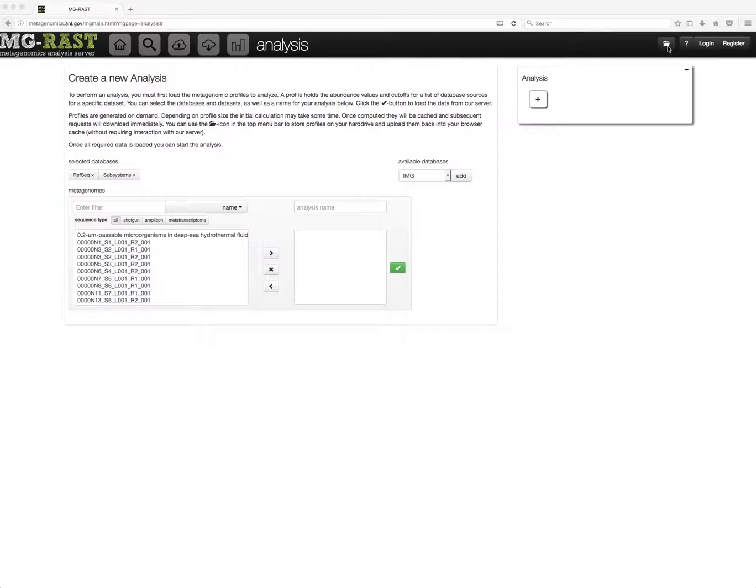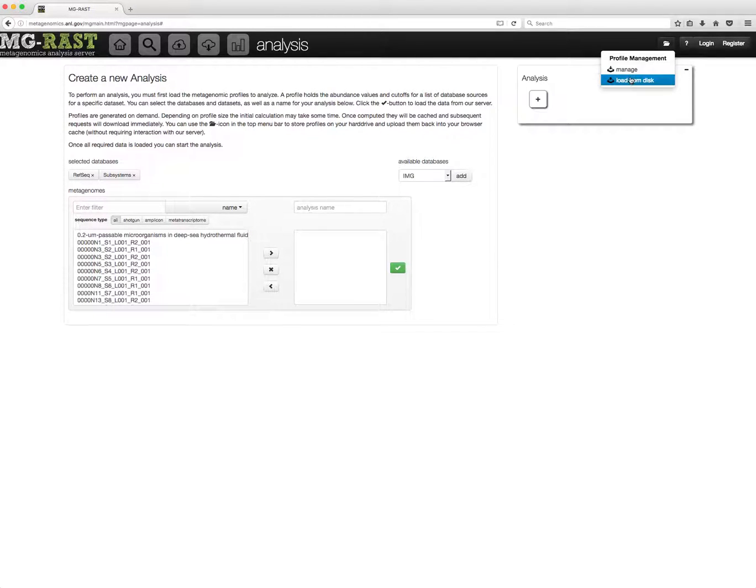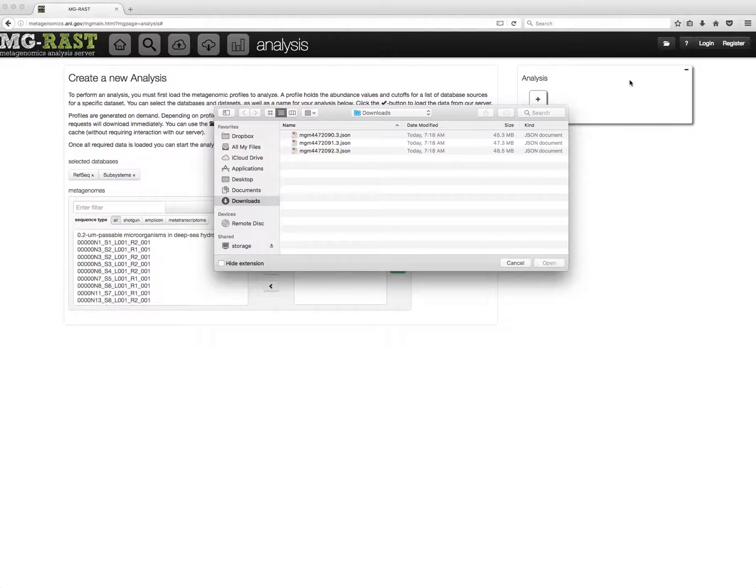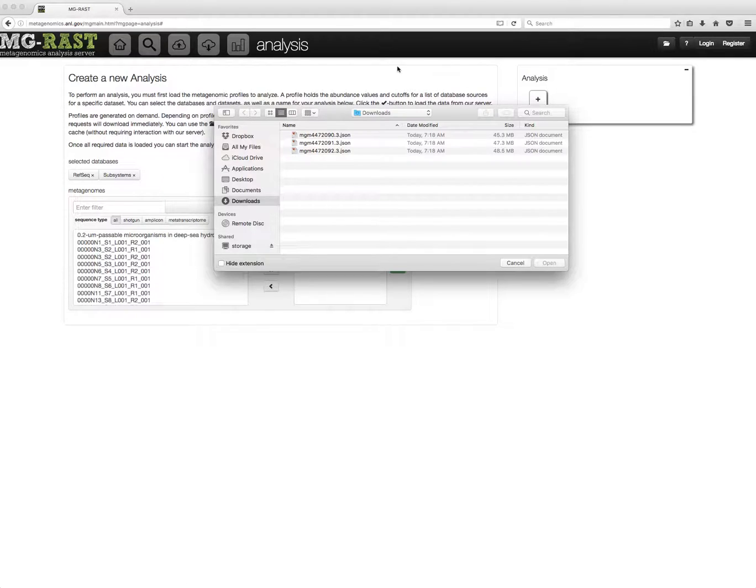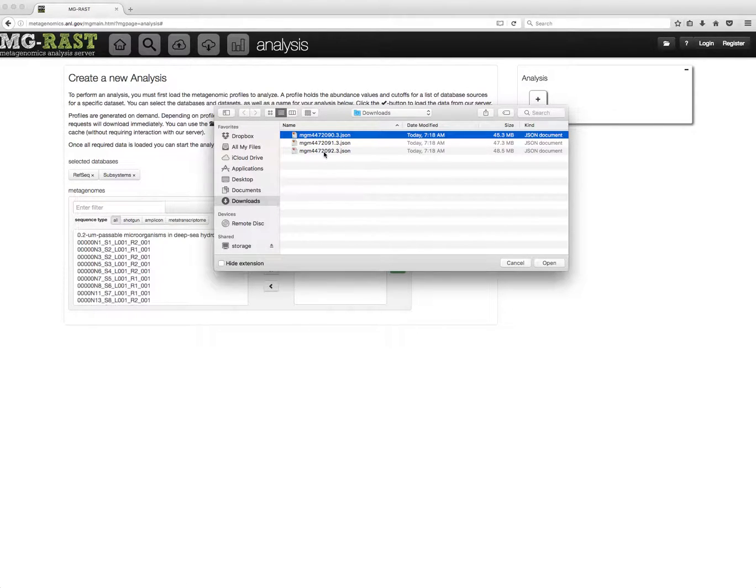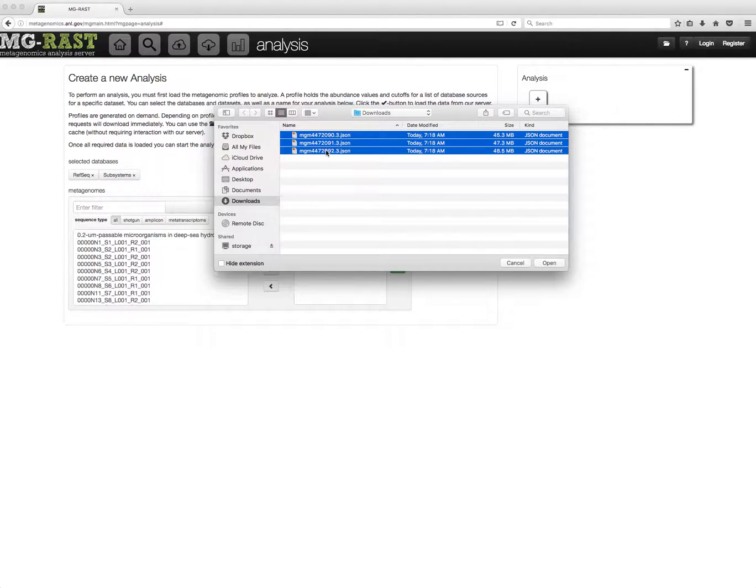Clicking the folder icon and selecting load from disk opens a file browse dialog that lets me select the files. Note that you can import multiple files at the same time.